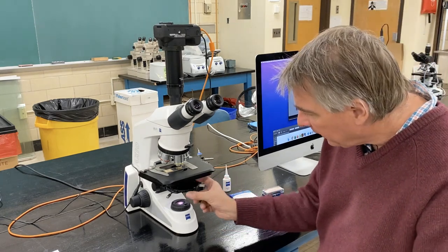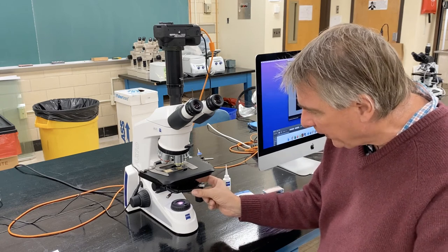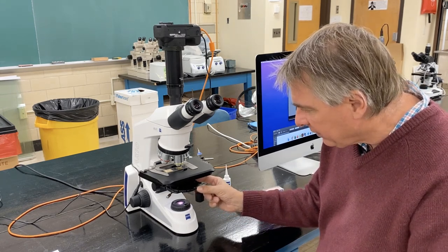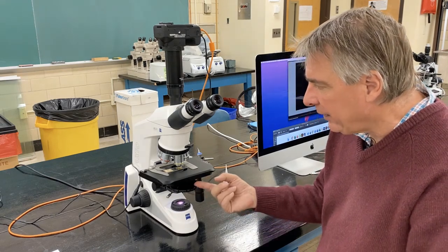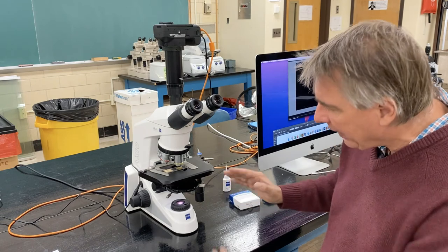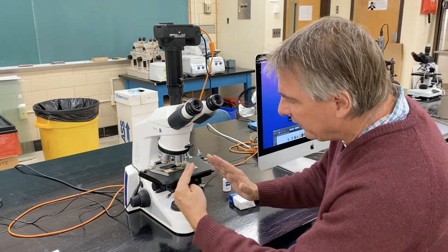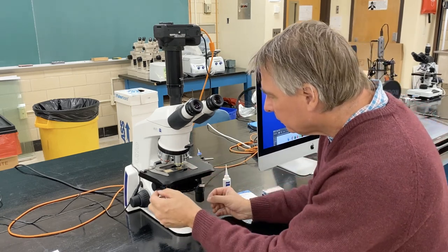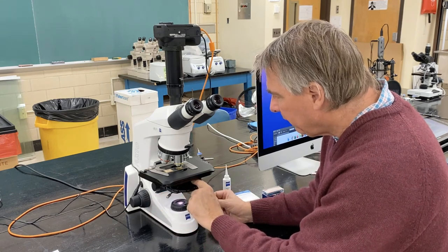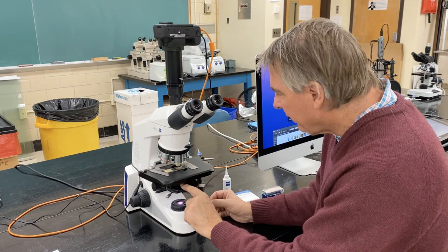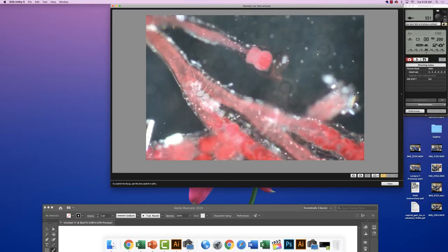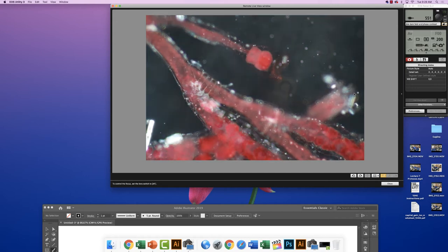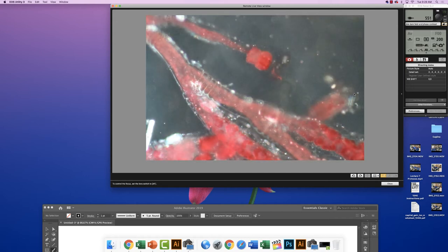For dark field, we rotate this turret, which swings the dark disk underneath the specimen. Now the light is coming up through little slits on either side of that dark disk to illuminate the sample. I'm going to open up the condenser aperture until we can see the specimen.